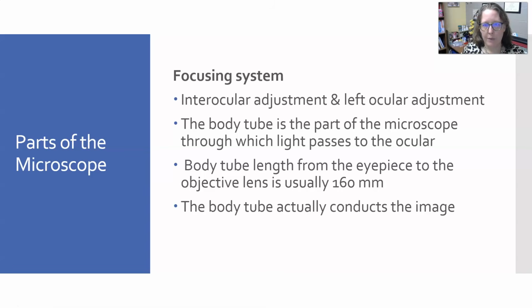And then, still part of the focusing system, you have interocular adjustment and left ocular adjustment. You can adjust how wide or close together the oculars are, but then you can also adjust on the left to adjust focus. You can rotate it and stuff.